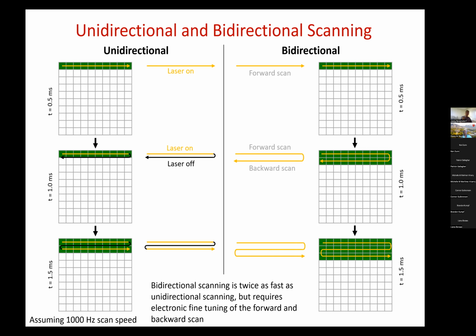However, it's electronically not that easy for the microscope manufacturers to implement it, because it not only has to work for one particular scan speed, but it has to work for all scan speeds the microscope offers, and for all zoom levels the microscope offers, which will each change the mirror motion that the scan mirror is experiencing.